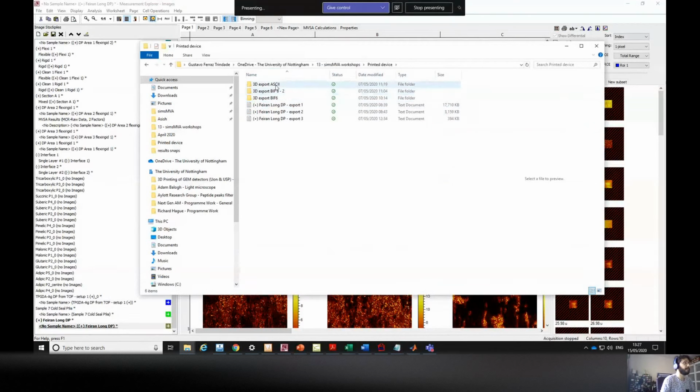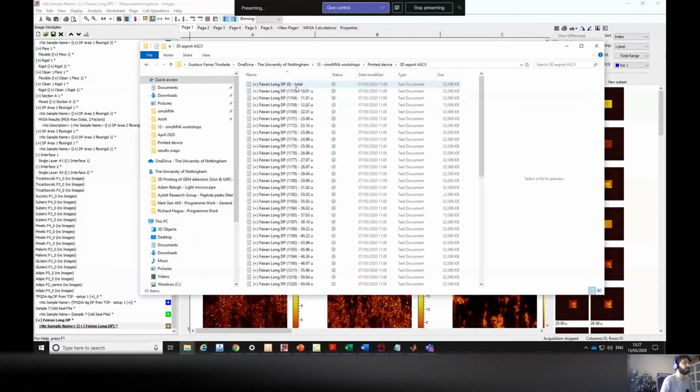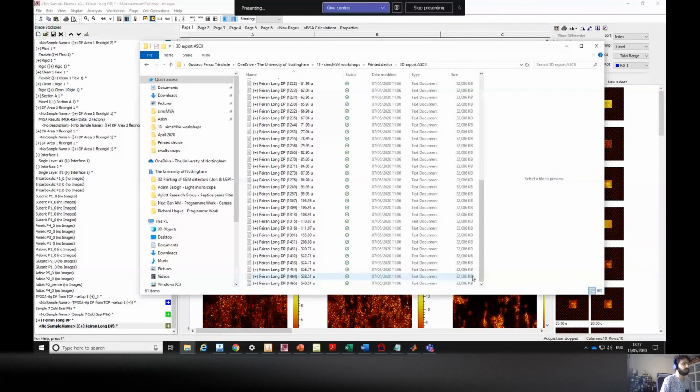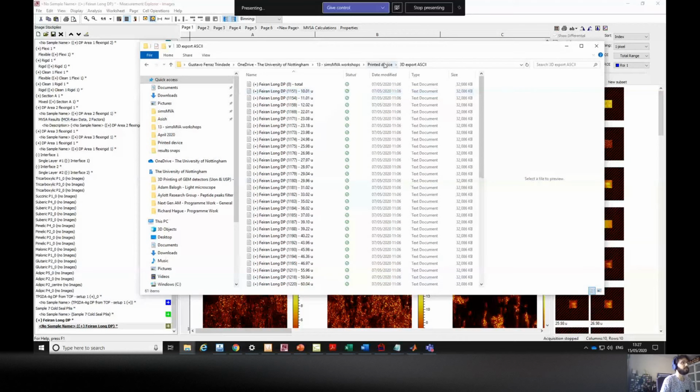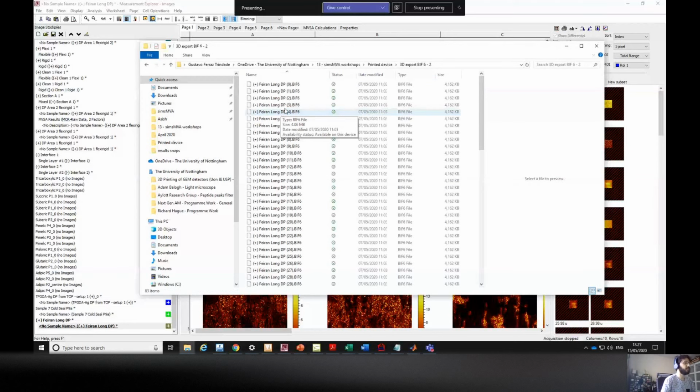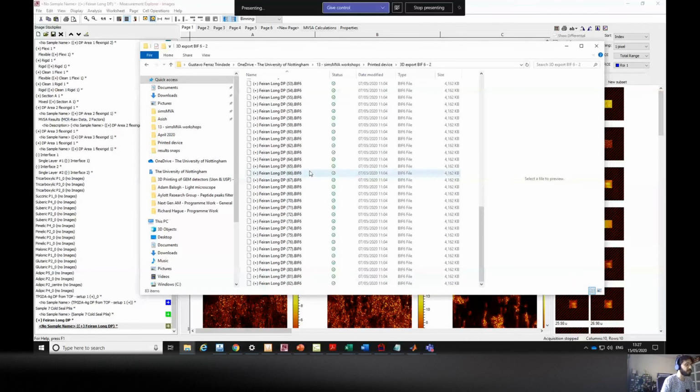With the text files, you have one file for each ion containing data for all the levels, all the scans. With the BIF6, you have one for each scan. Here I was merging several levels. I was merging every 100 levels, so I end up with 82 files only.